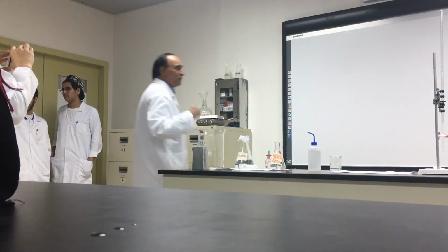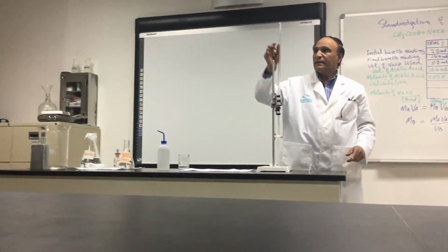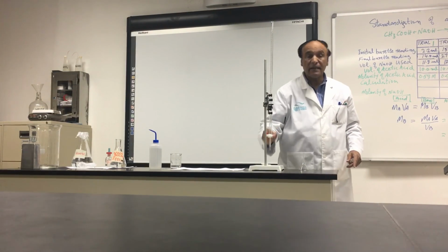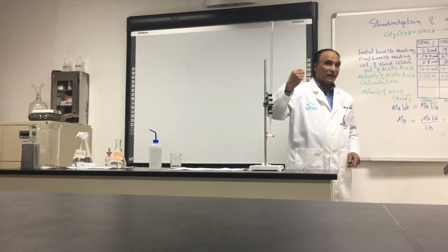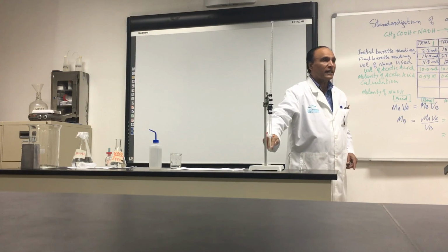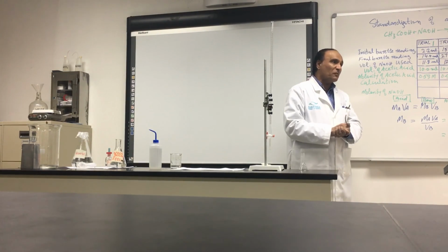Very important point before doing the calculation. Boys, listen, very important point. There is sodium hydroxide inside. That sodium hydroxide can react with the carbon dioxide in the air to form sodium carbonate. And there will be a solid here, so it will close the tip. The other student will come, it will be a problem for him.